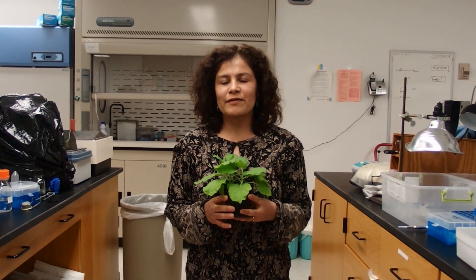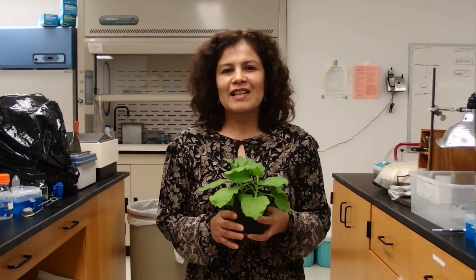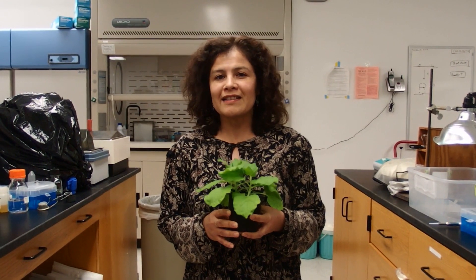The white tobacco plant, Nicotiana benthamiana, is a popular system for transient gene expression. Some of the most common uses are for subcellular localization and gene function studies.